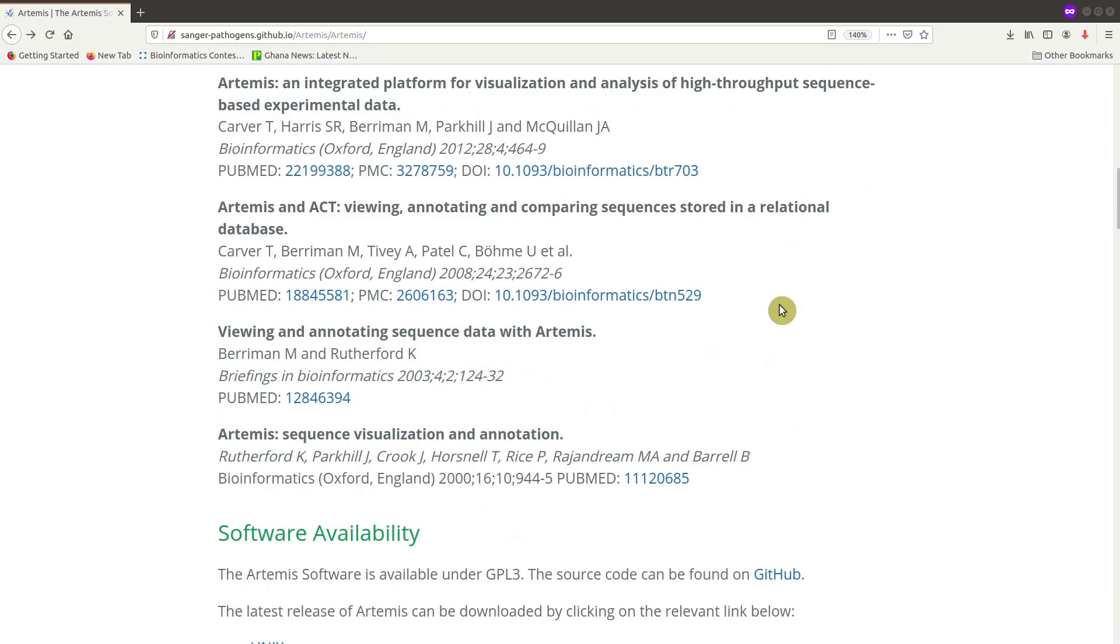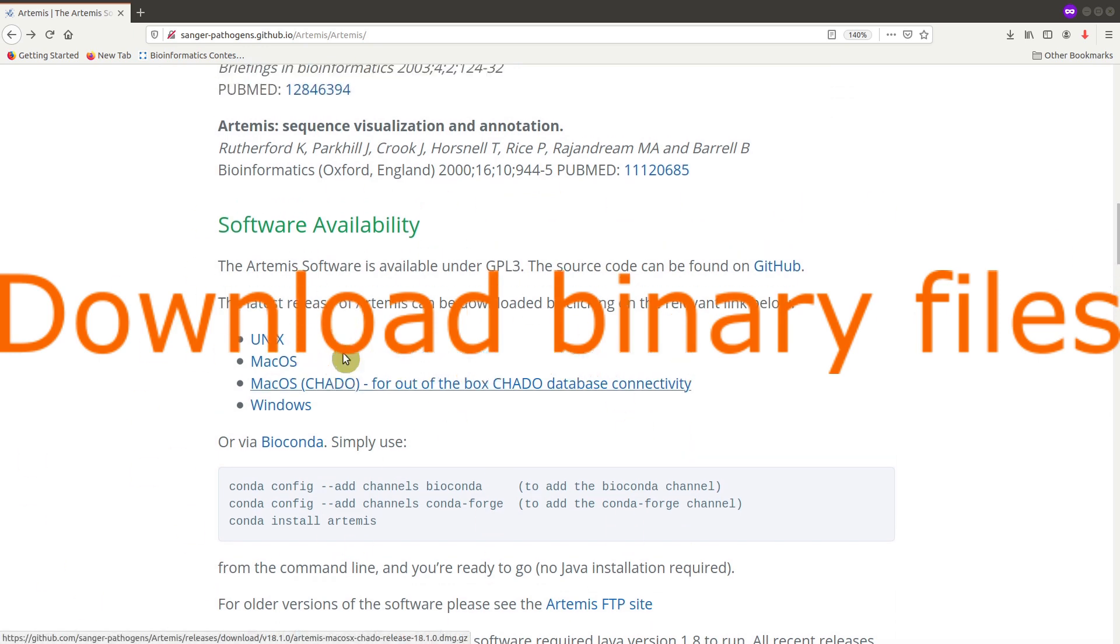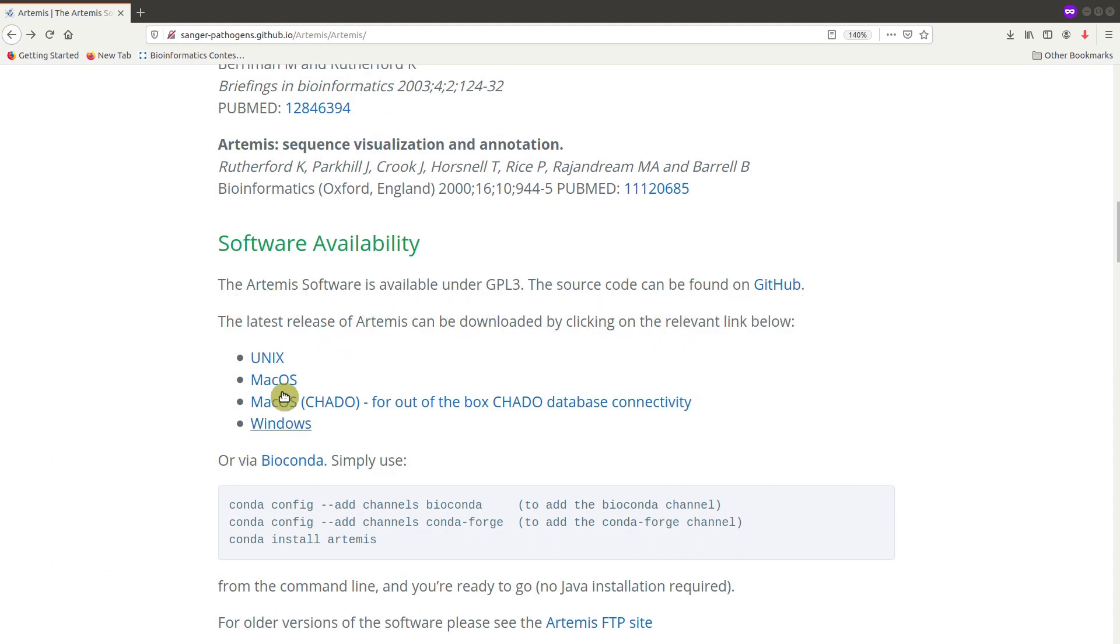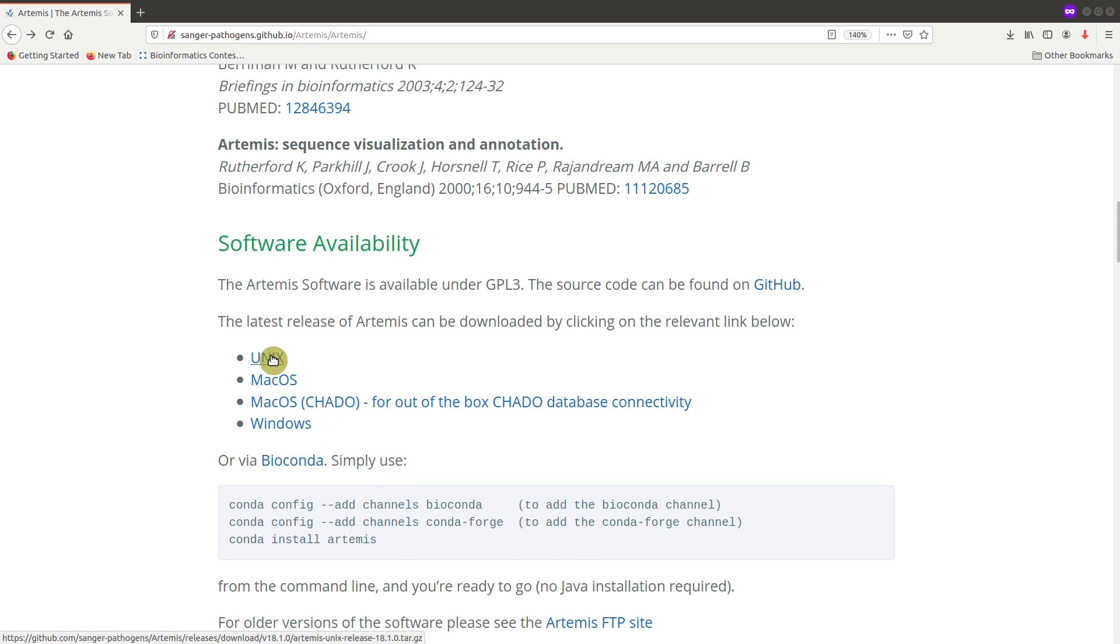So on that page, you scroll down until you get to this section. So these are the binary files available for you to download. So it will depend on your operating system. Then you select the appropriate one. I am using a Linux system. So I'll select the Unix one.